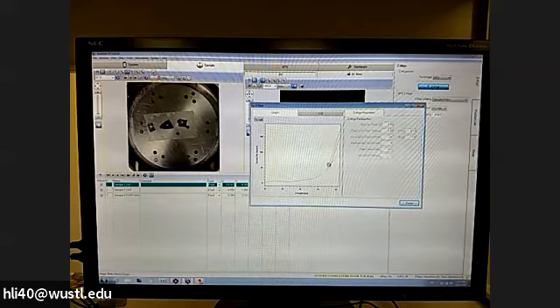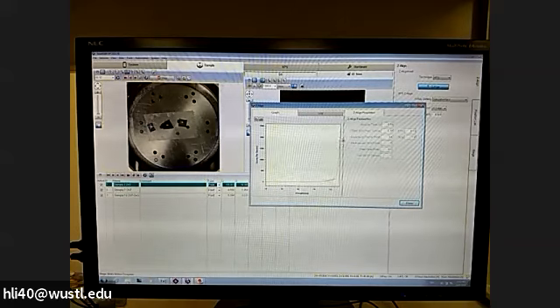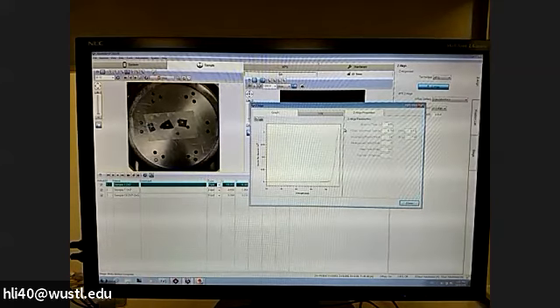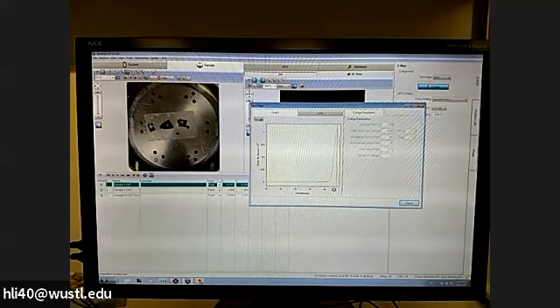The software will automatically come back and then run in a smaller final step to see where the highest peak is. When the count is highest, it means that place is the optimum position for you to do analysis. So you see it's still increasing. Okay, here is a peak. Your sample is supposed to be in this position in order to take a spectrum. Okay, that's good.